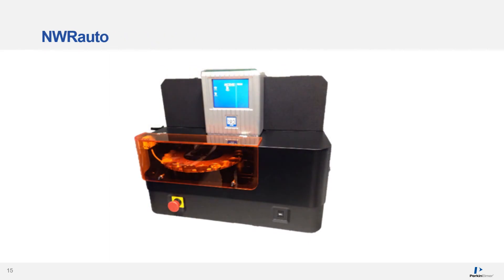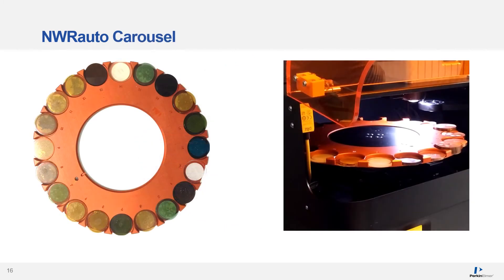One response to these laser ablation ICP-MS limitations is the NWR Auto. It can handle from 20 to 2,000 samples using sealing technology to ensure that each sample and standard analysis is totally reproducible and performed under precisely the same conditions. Here you see the NWR Auto carousel used to introduce samples to the laser, with X-ray beads on the left and copper pellets in the carousel to the right.